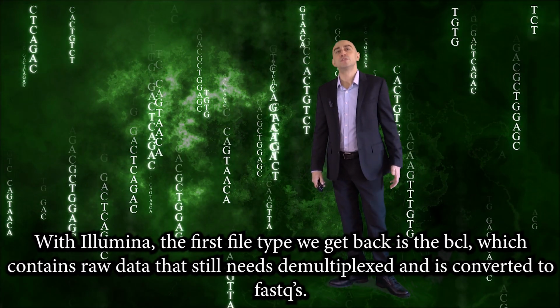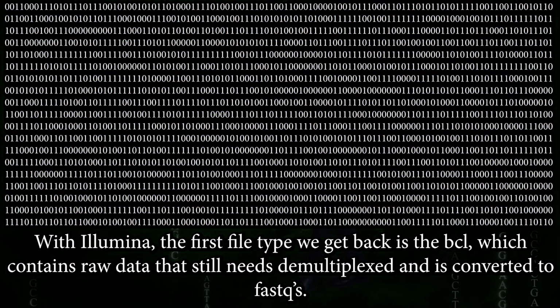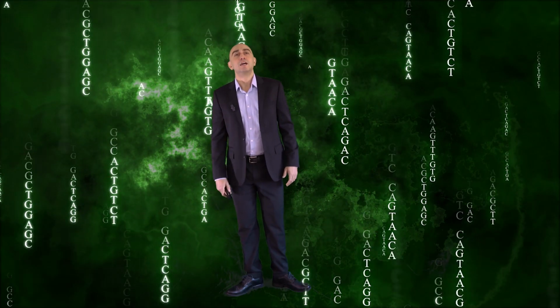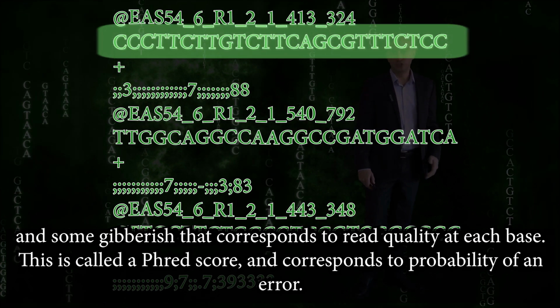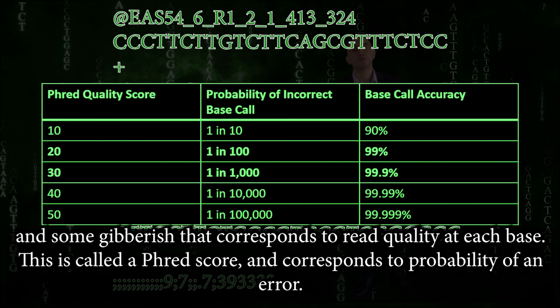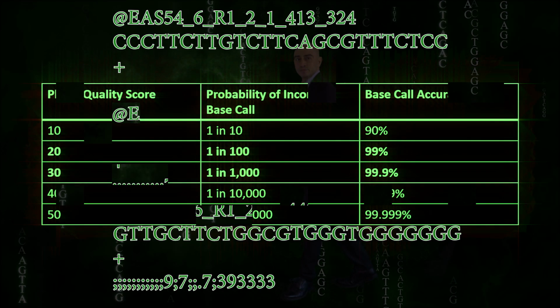With Illumina, the first file type we get back is the BCL, which contains raw data that still needs demultiplexed and converted to FASTQs. A FASTQ file looks like this. You have some data about the read, the sequence itself, and some gibberish that corresponds to read quality at each base. This is called a Phred score and corresponds to probability of an error.